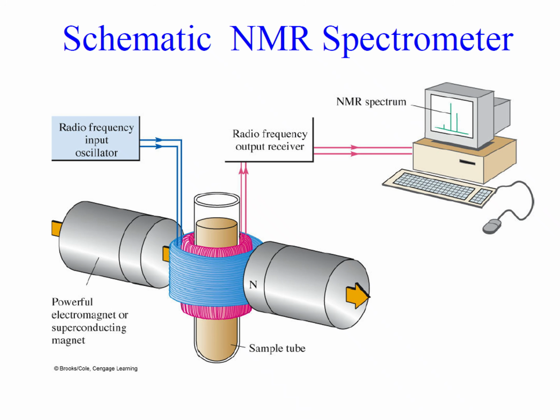In UV spectrometry we use the UV spectrum, in IR we use the infrared spectrum, and in fluorometry we also use UV. In X-ray diagnostic techniques we use X-rays. But in NMR only a low frequency wavelength, that is radio frequency, is enough to cause the transition, to cause a shift. So we'll see the overall principle below.